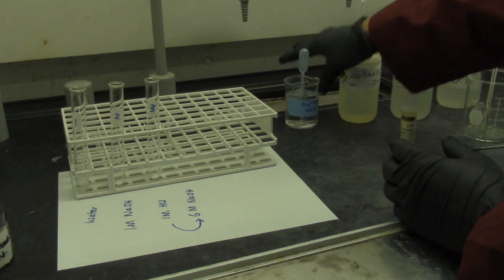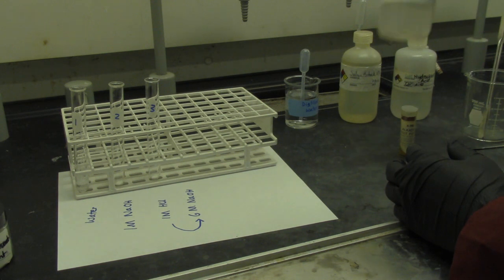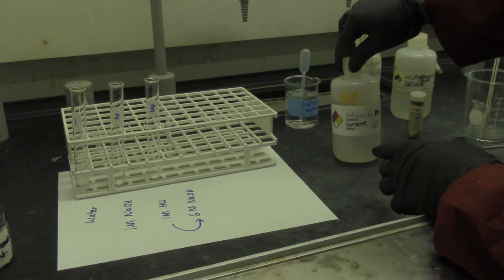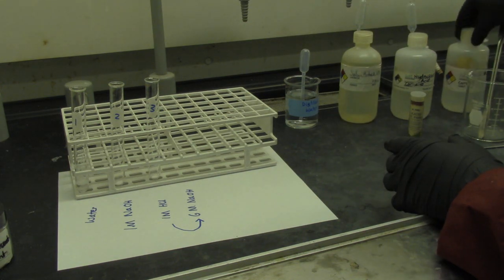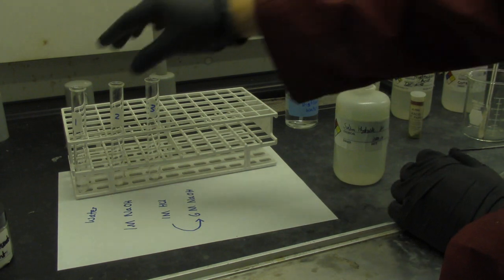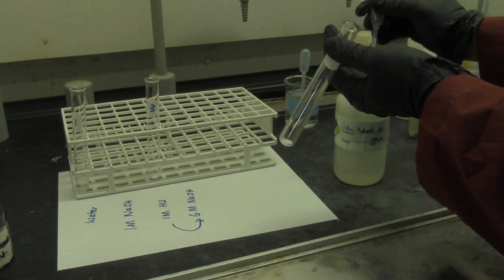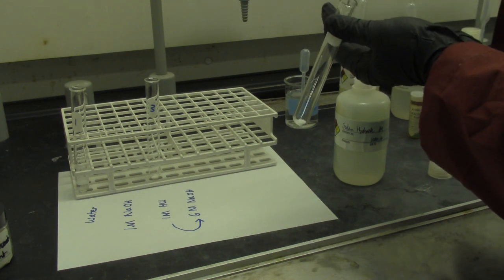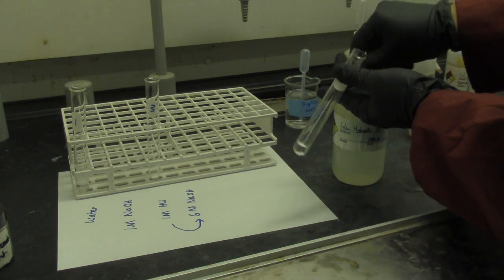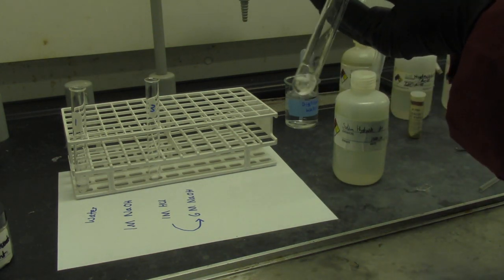To the second test tube, I will add 1 molar sodium hydroxide. Here it is. And stir.